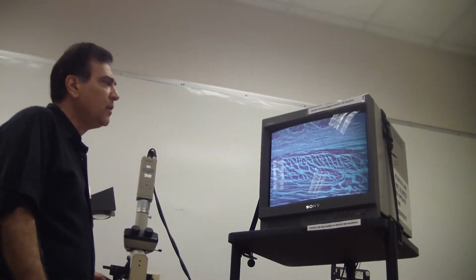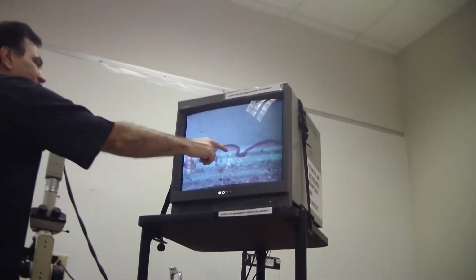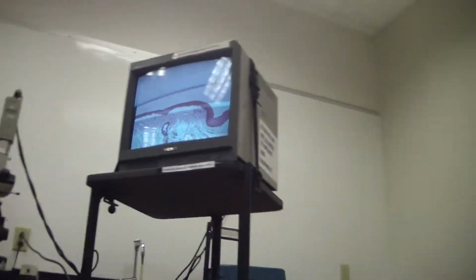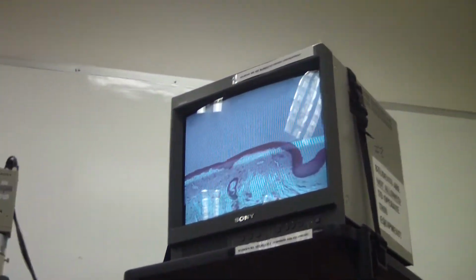So you have done whatever I'm asking you in the handout. But if you really want to see, because you don't want to just trust whatever I tell you, right? You want to take a look at those stratified squamous cells, and that's why on the side, they magnify that for you. They magnify the stratified squamous and put them on the side so you can see.